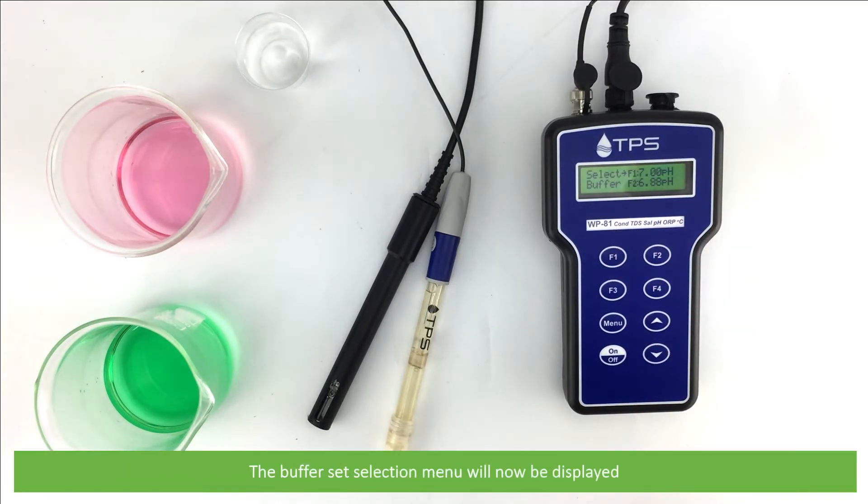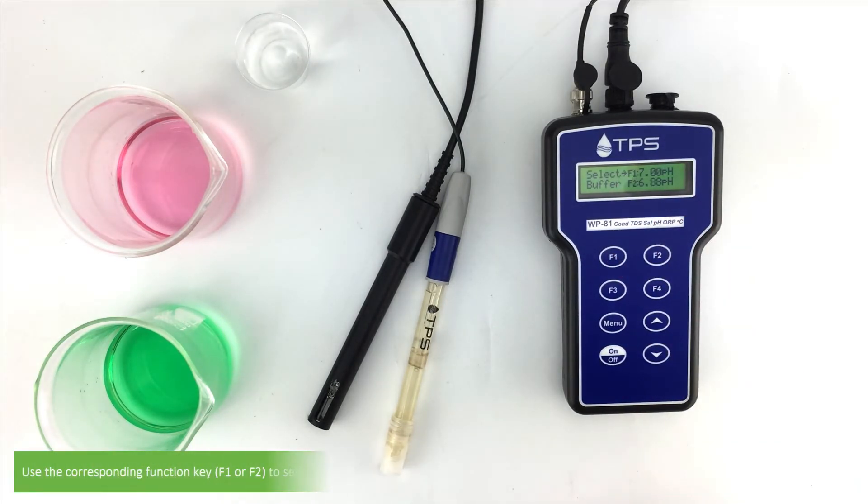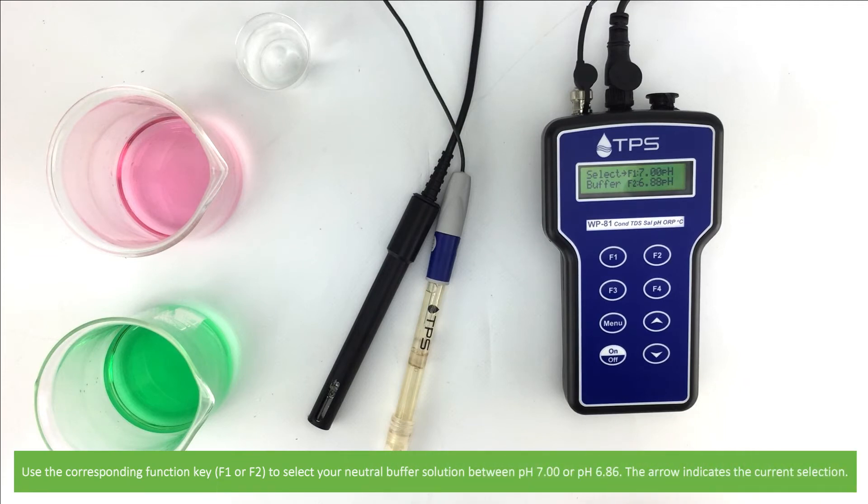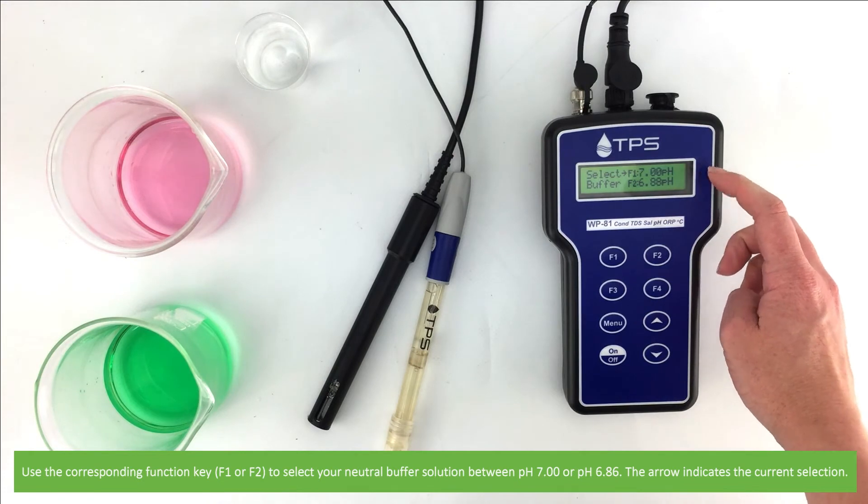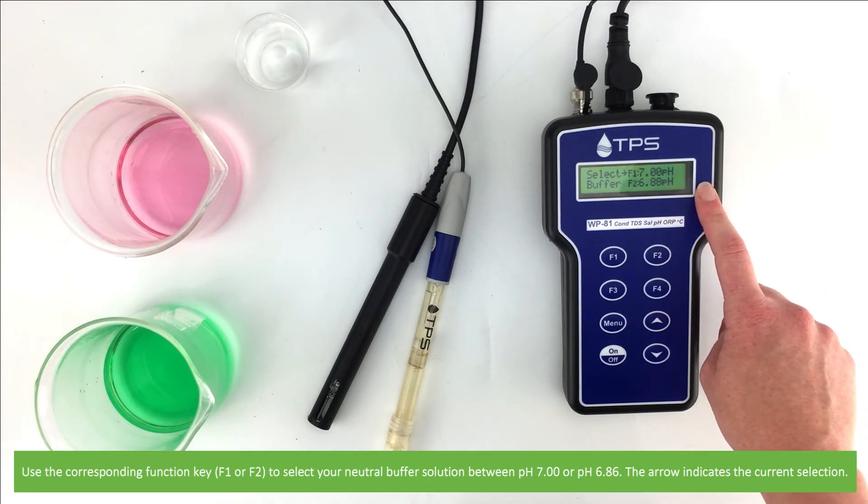The buffer set selection menu will now be displayed. Use the corresponding function key, either F1 or F2, to select your neutral buffer solution between pH 7 or pH 6.86. The arrow indicates the current selection.